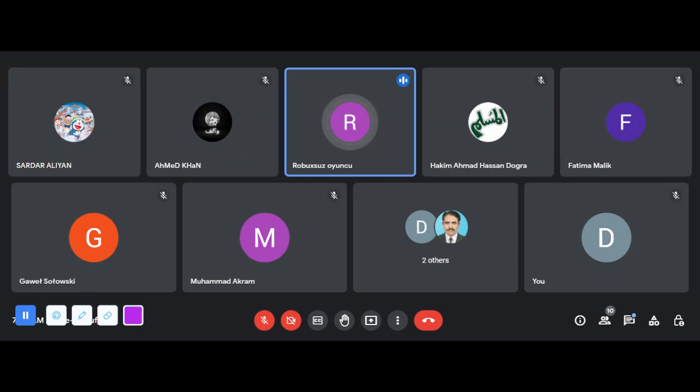insert it in the medium. This medium is MS Murashige and Skoog, Gamborg's B5, and other media. These media are used in plant tissue culture. We use solid and liquid medium in plant tissue culture to produce secondary metabolites. We use precursors and elicitors.